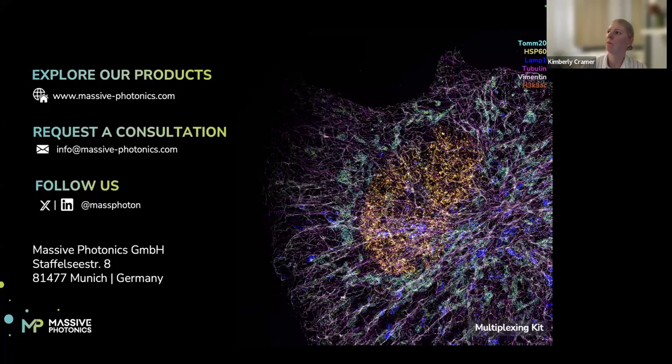Yeah, sure. So the easiest way to start DNA paint imaging is to first have an established immunofluorescence protocol. For example, you've done diffraction limited imaging or even STORM imaging. So you have a working immunofluorescence protocol. And then, for example, you could use our kit for the GFP tagged protein.